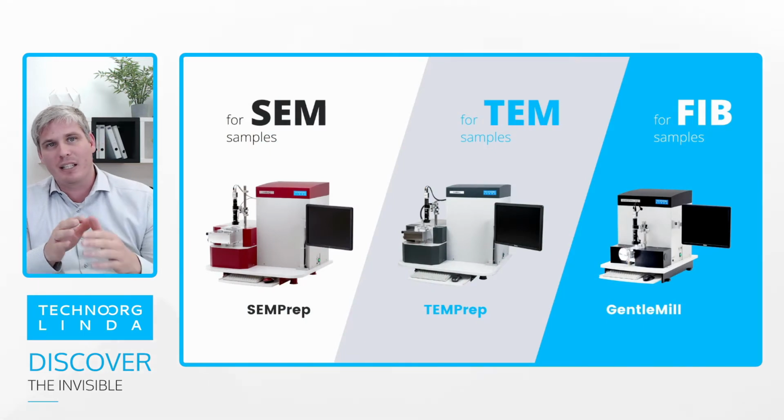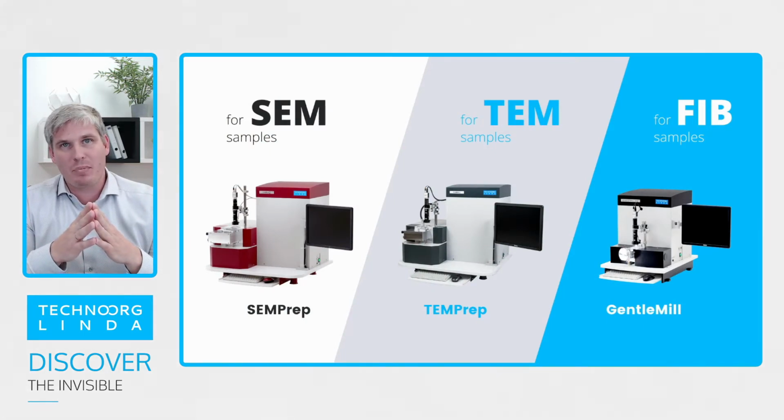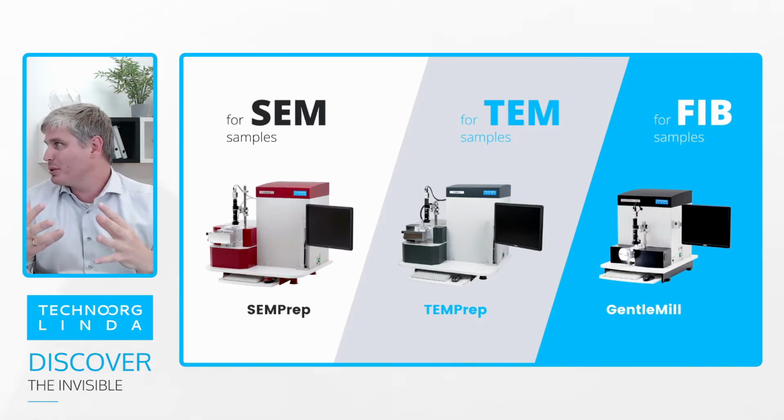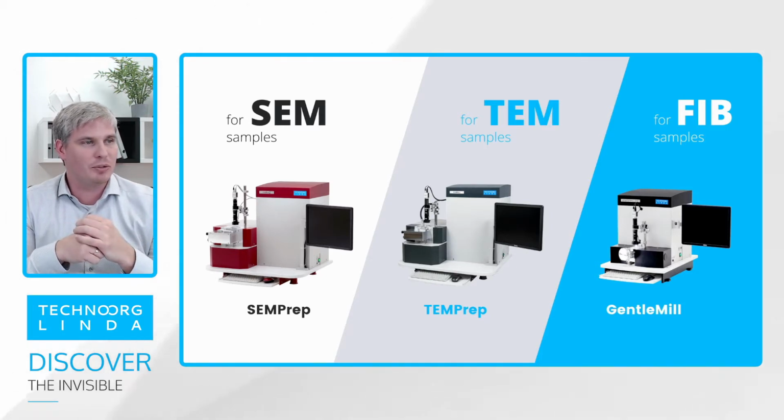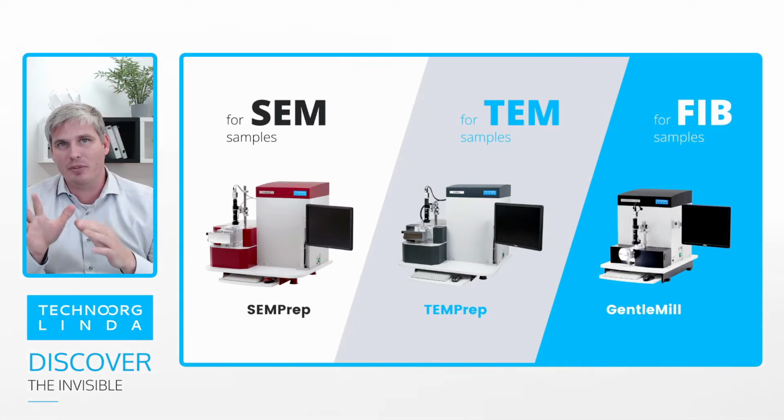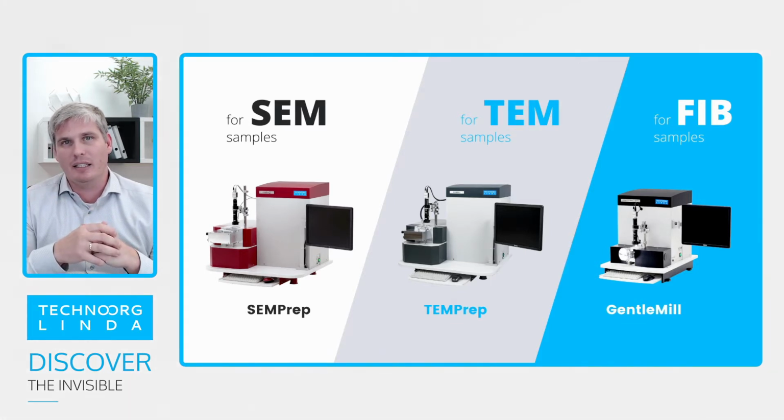Basically, in all fields of electron microscopy, the ion milling technique is commonly used because it is a gentle enough approach to help you achieve the ultimate goals. We will talk about the TEM samples, including the FIB lamellas, in detail, and György will show us how to handle them.